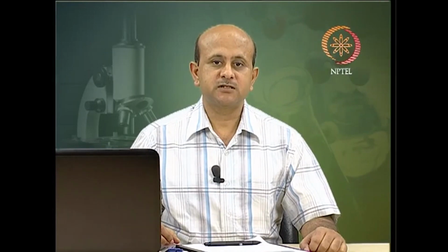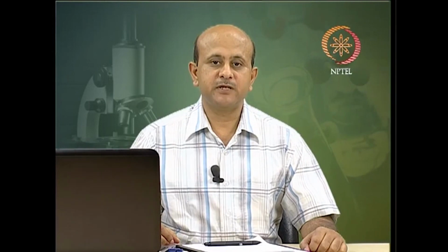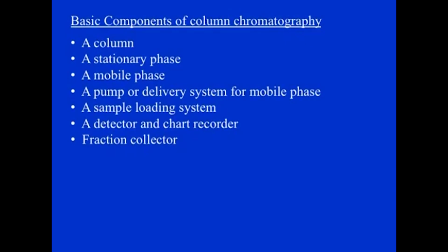In previous lectures we have dealt with the basics of chromatography, that is, we have discussed the basic concepts in chromatography, and we have also discussed the various performance parameters of chromatography. Now, in this lecture we are going to extend our discussion on column chromatography, the most widely used chromatographic method. What are the basic components of column chromatography?